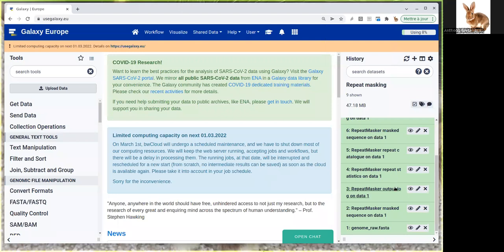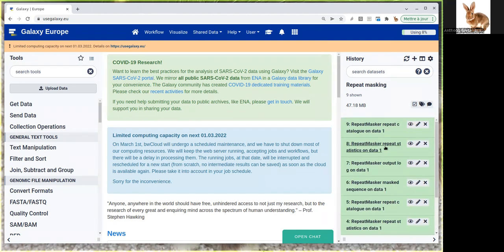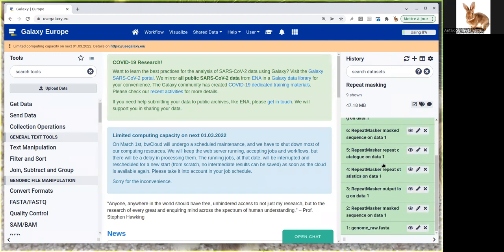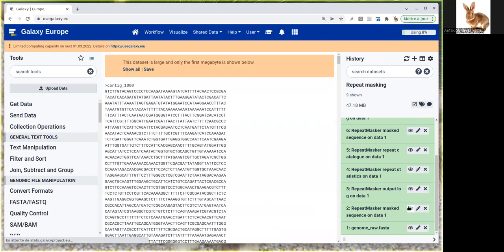Now all the datasets are green. It took nearly half an hour to compute this repeat masking on usegalaxy.eu, but it depends on the server load as usual. We're going to look at the outputs of our two repeat masking runs. Each one has four output datasets. The first is the masked sequence.